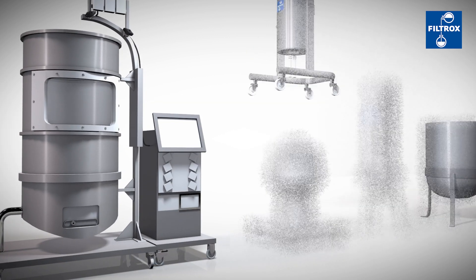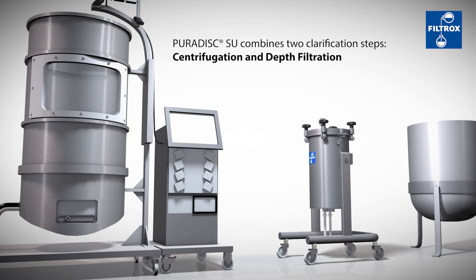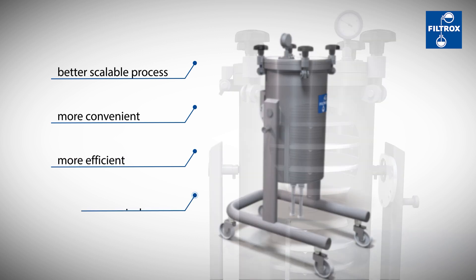The PuriDisc SU combines the first two clarification steps: centrifugation and depth filtration. This makes the process better scalable, more convenient, efficient and economical.